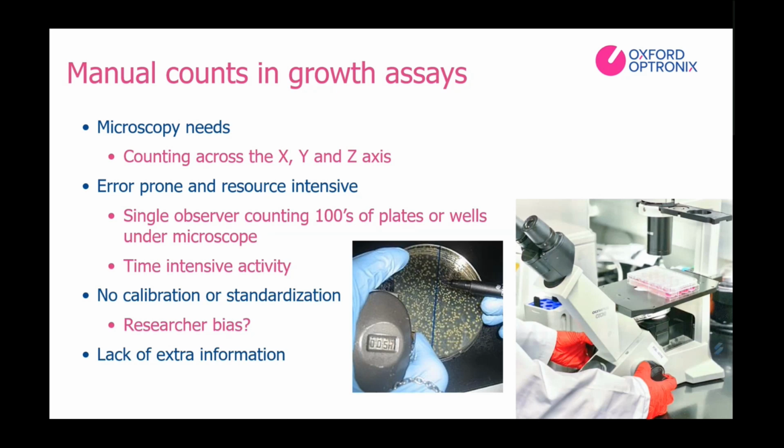It should also be noted that the repetitive and tedious task of counting organoids can cause both physical and mental fatigue, which can seriously affect the accuracy and reproducibility of results, especially across large counts. And studies have actually shown that human error from investigative fatigue is such a serious problem that errors of 100% or more have been observed in lengthy counts. Moreover, manual counts can be further compromised, either wittingly or unwittingly, by the bias of a researcher whose expectations about the outcome of an experiment impact their counts.